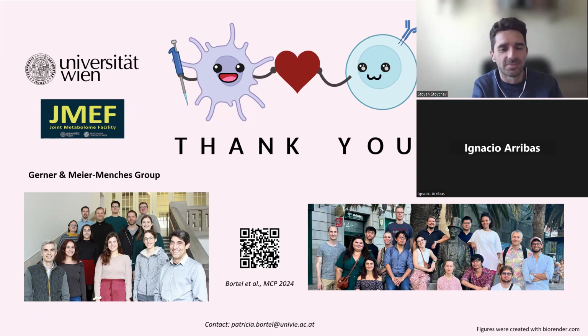Thank you, Patricia. No, I meant that since you tested your optimal conditions for phosphopeptide enrichment with the sequential enrichment and proper volume, etc., in the Astral, I wonder if you also had the chance to test the standard conditions recommended for the IMAC beads in the Astral, and compare the results and whether there are any differences in the identifications.